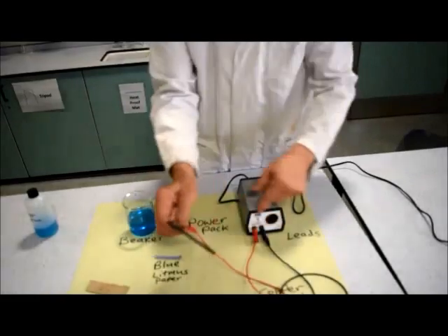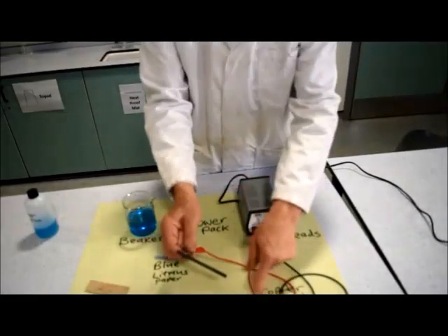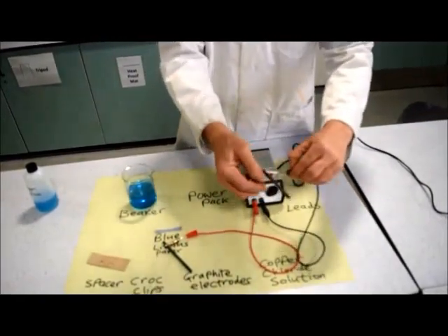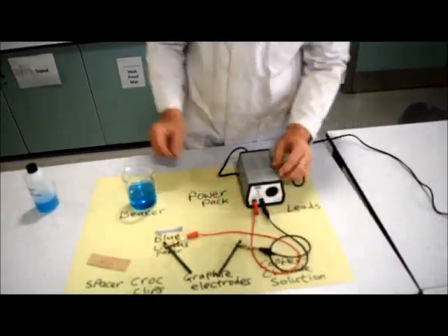The red lead is the positive lead, so this is going to be our positive electrode, and the black lead is going to be our negative electrode.